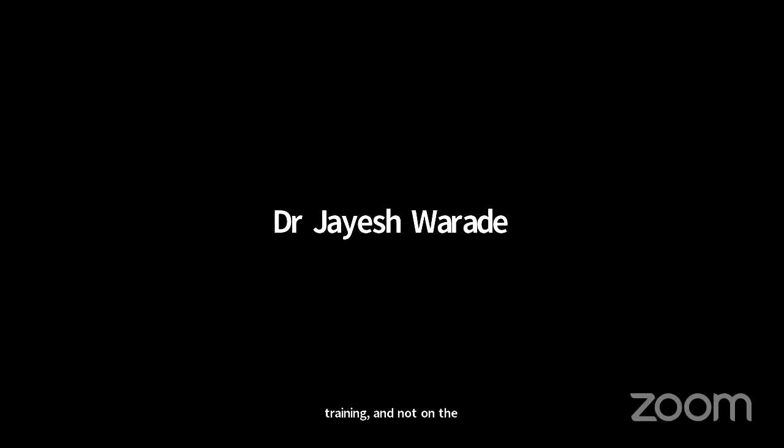Yes, Mindray will provide you a competency assessment tool for handling their equipment. They have a checklist. If you contact the service person, they will give you a checklist on how you can assess the competency of your staff, how they are working on the equipment, and how they are following the protocols. Ask their contact person. They will surely help you with a competency assessment tool for handling their equipment.